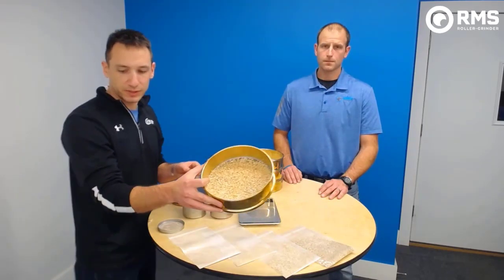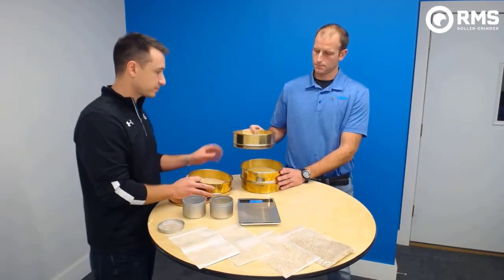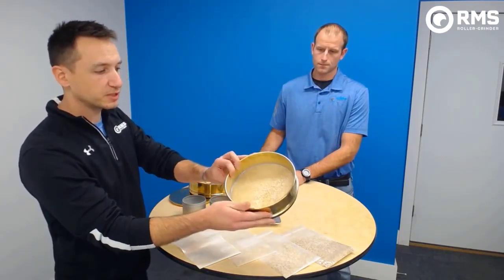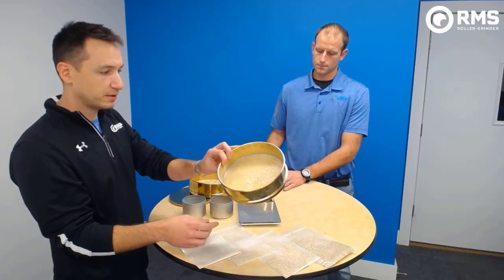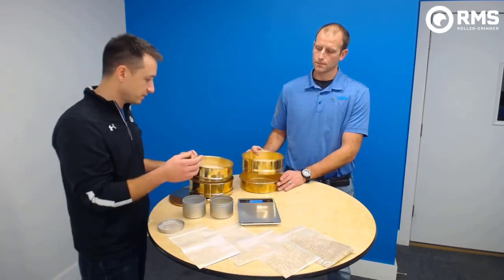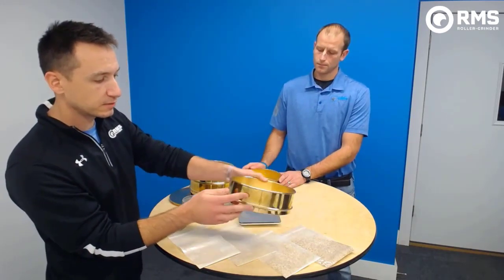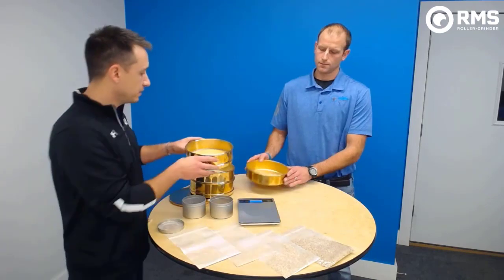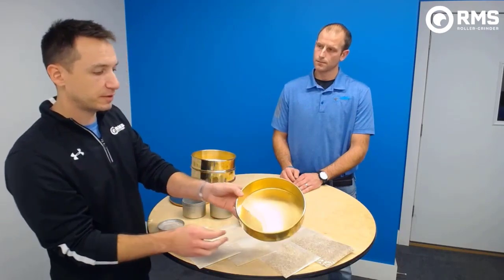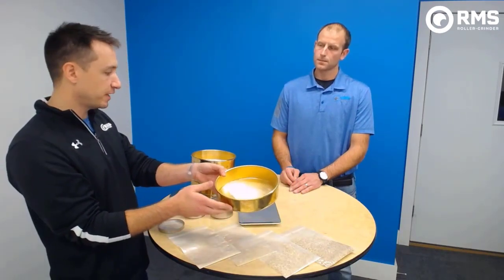Here's our 14 sieve, and here's our 30 — you can see the particles in there are quite a bit smaller, and you can see a little bit of husk in there. So this is going to be your coarser grits. At 60, that's your fine grits. And then in the bottom pan is all your fine material — really the dust, the really fine material, ends up in the bottom of that pan.